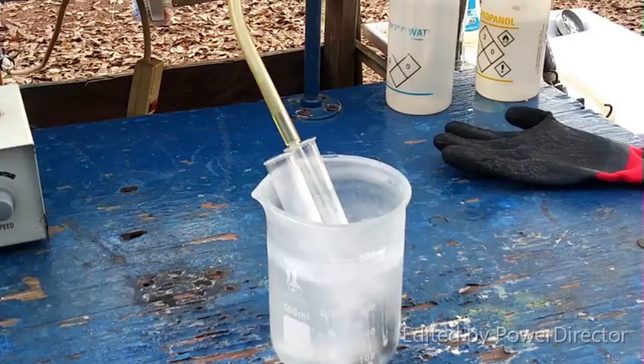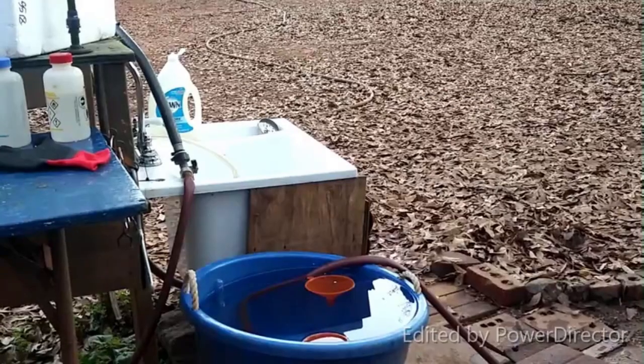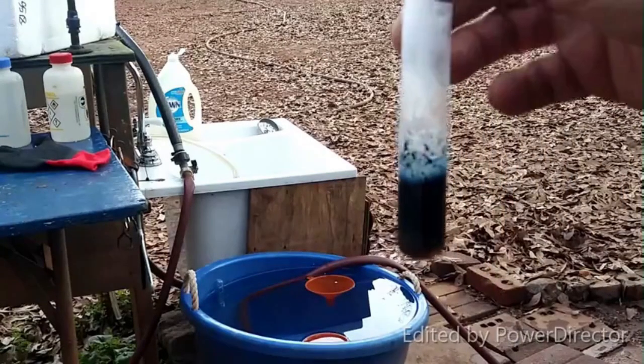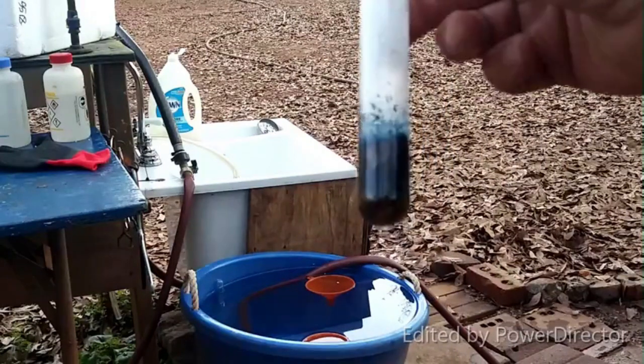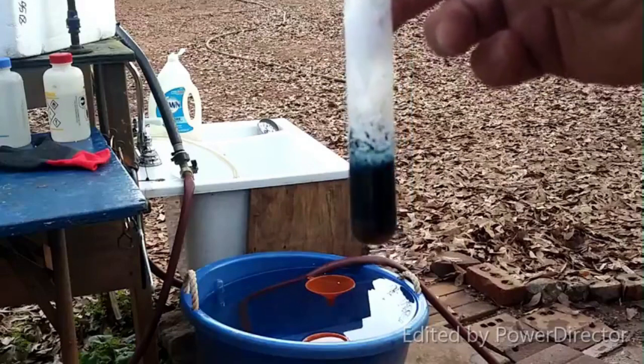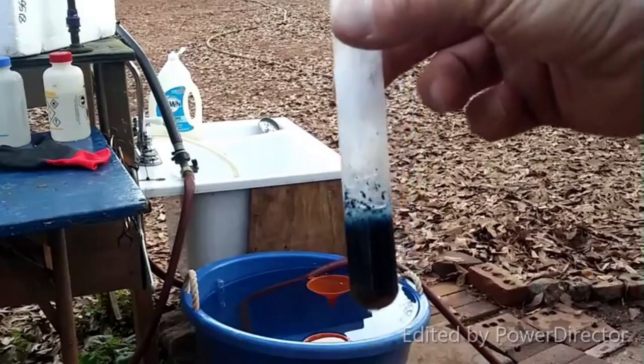I just asked myself — what happens if you drop a test tube full of barium amide and stuff into water? This might be an extraordinarily bad idea, but let's find out.